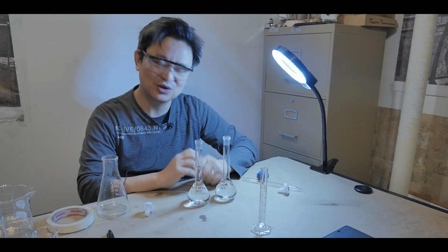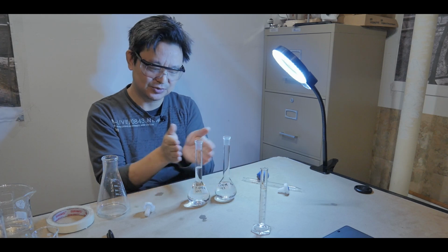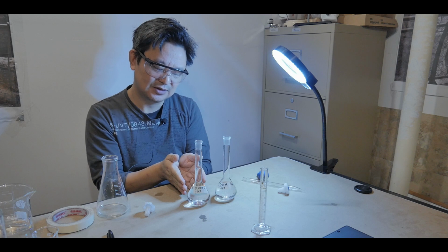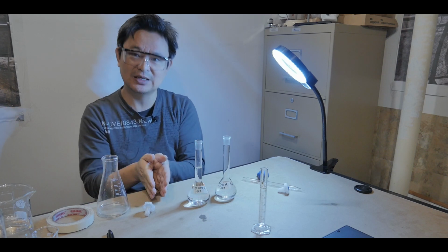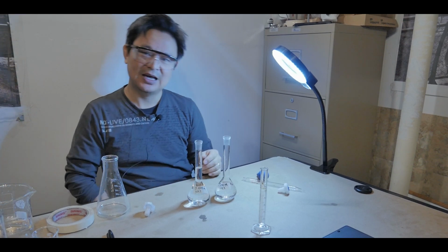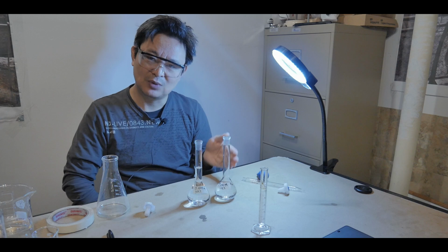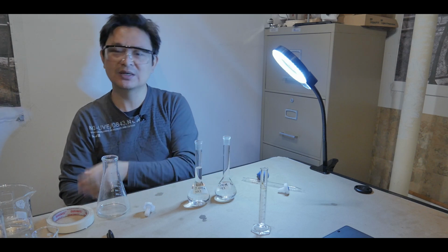All right, so that's how you do serial dilution. You take the 10 mils of the concentrate, put it in the empty volumetric flask, add the 90 mils, and you get a tenth of that, and you keep doing that, and you get a tenth, a tenth, a tenth of that, and you'll dilute it down from 1 molar to 0.1 to 0.01, 0.001, 0.0001, and so on.